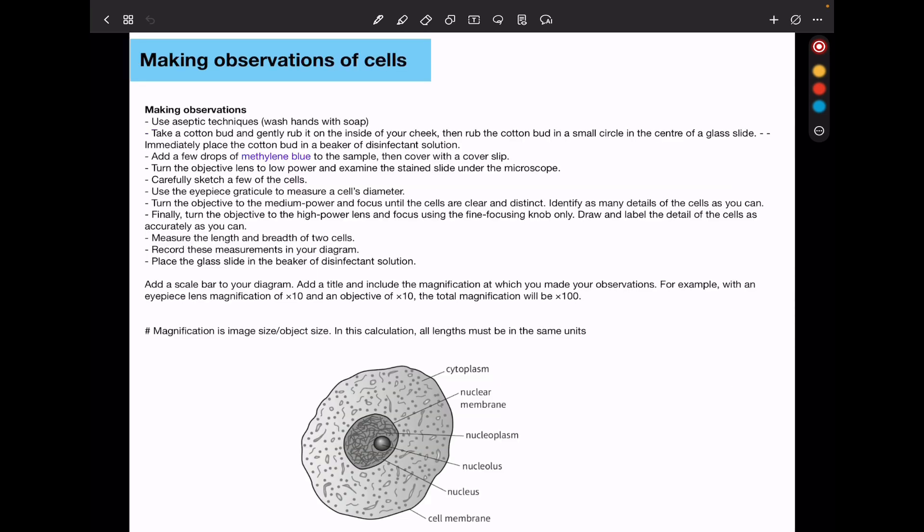Now, like I said, we're ready to observe the cells. We will observe at low power and at high power. However, we have to gather tissues containing the cells, find ways of staining them, and then place the materials onto a microscope slide and be able to visualize under low power. And then at high power, then we can be able to draw.